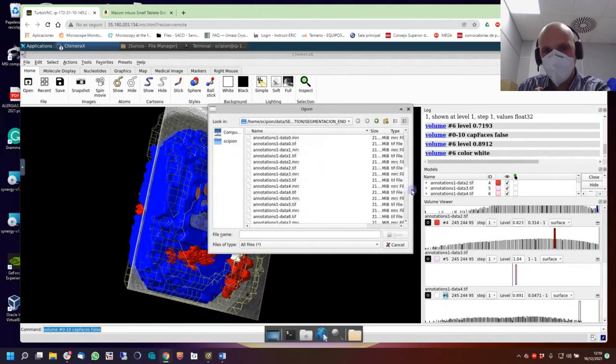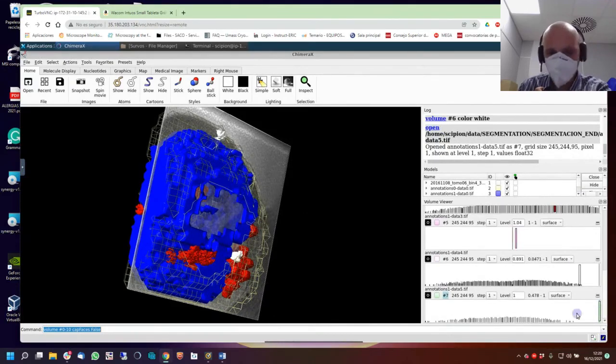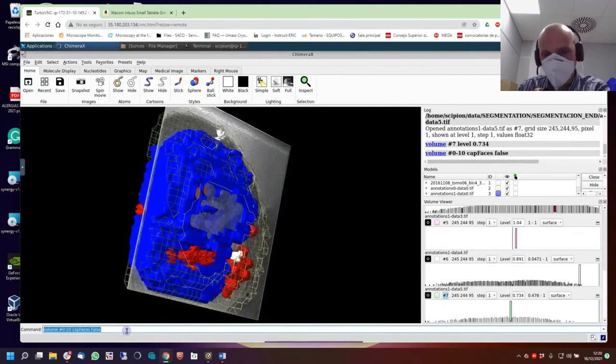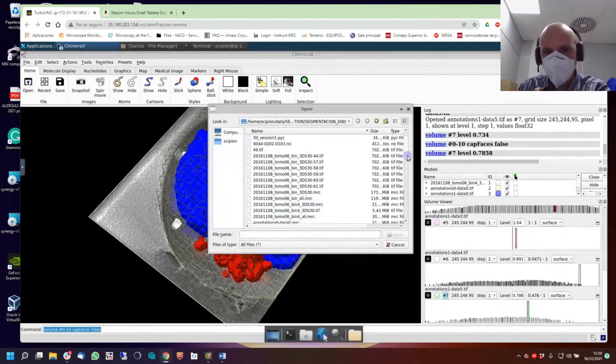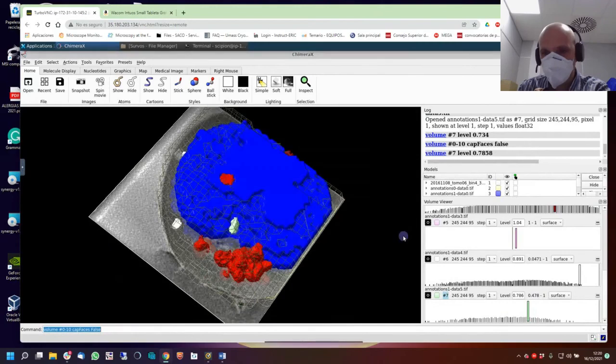5. It appeared. Yeah, oh, the same thing, doesn't matter. Yeah, this is one centrosome. Open. Oh, for today it's in green. I love this one in green. 5 and 6. Open. Yeah, the other one. You see it?